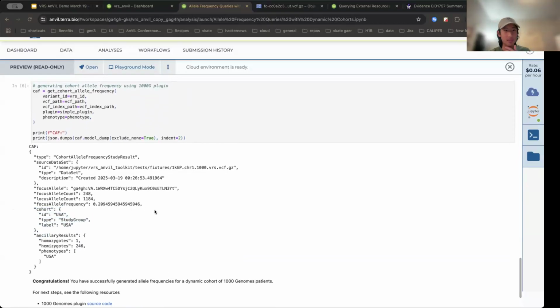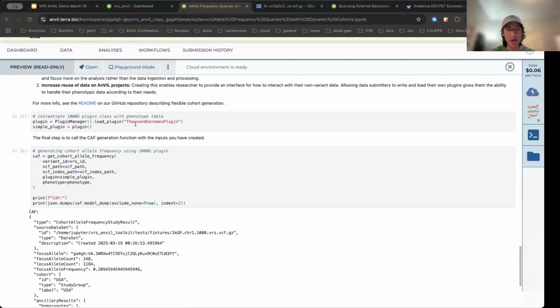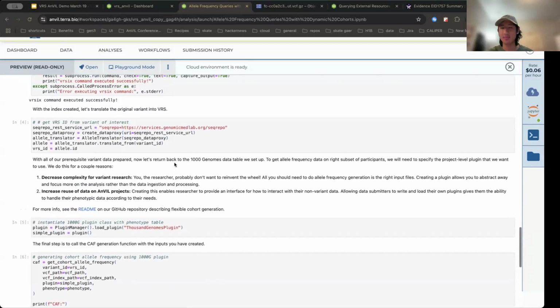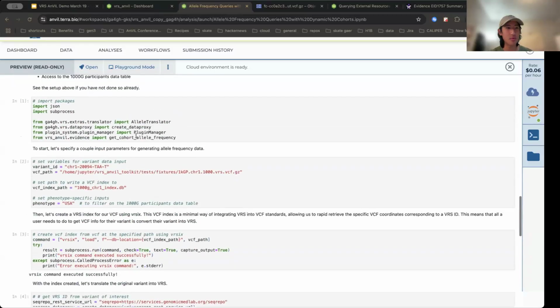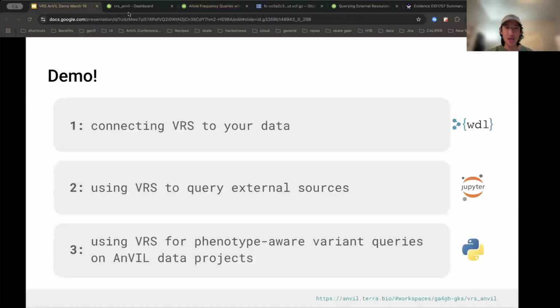That preference is part of this demonstration where, since we don't have access to Gregor outright, we work with 1,000 Genomes data and filter down a cohort of 1,000 Genomes data based off of maybe their country of enrollment or based off of other details that might be available to them. And so creating a framework for that is part of the ongoing process that we're doing at the Toolkit. And I just wanted to leave that for y'all as a final thing.